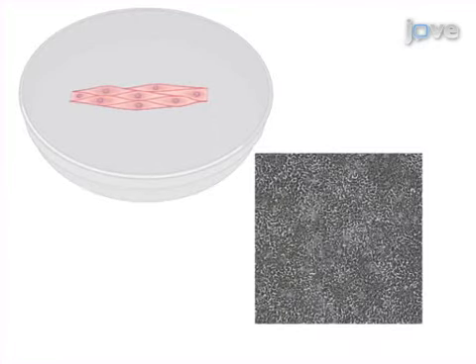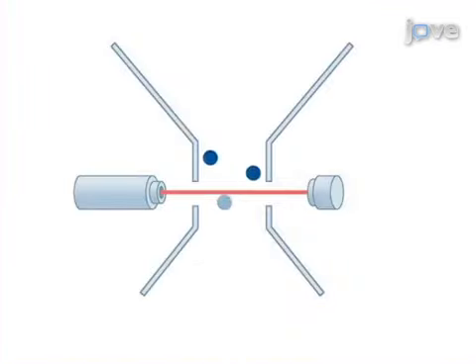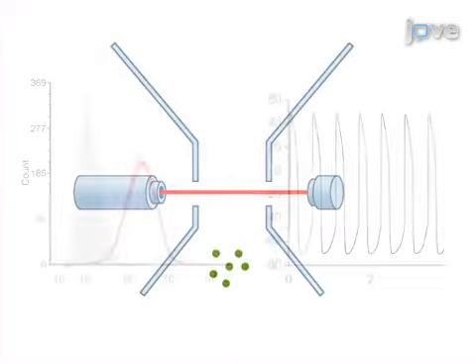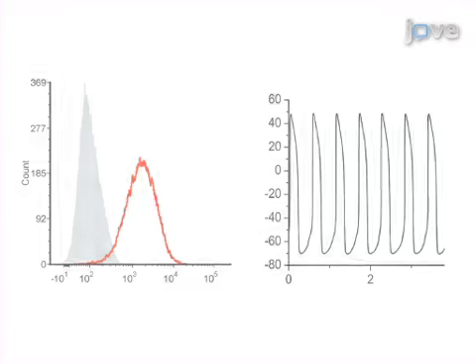Next, the cardiomyocytes are fixed, permeabilized, and stained using conditions that are specifically optimized for each antibody. Finally, the cells are analyzed by flow cytometry. Ultimately, results can be obtained that show cultures that are highly positive for cardiac markers TNNI3 and IRX4 and demonstrate ventricular-like action potentials.